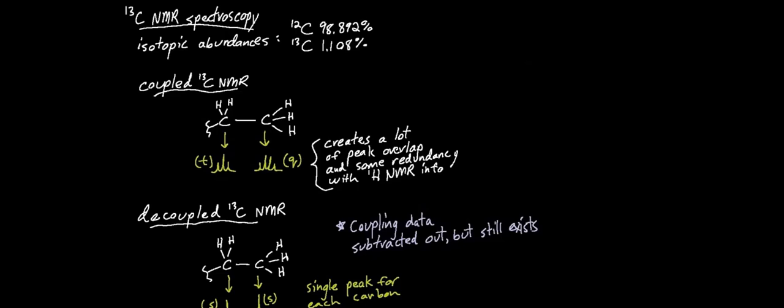Onward to carbon-13 NMR spectroscopy. We're lucky in proton NMR that the most abundant isotope is the one that's also visible in the proton NMR spectrometer. That's not the case with carbon. The visible isotope of carbon for NMR is the less abundant, although, as it turns out, it's just abundant enough to see. Carbon-13s are represented in all the atoms of a molecule in a mixture because there's so many molecules in that mixture.